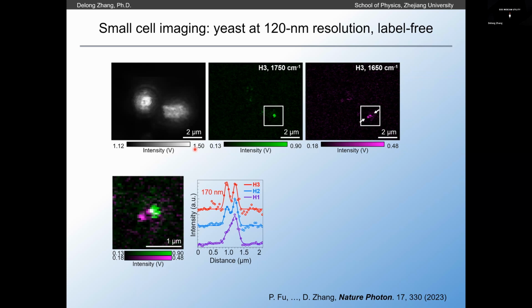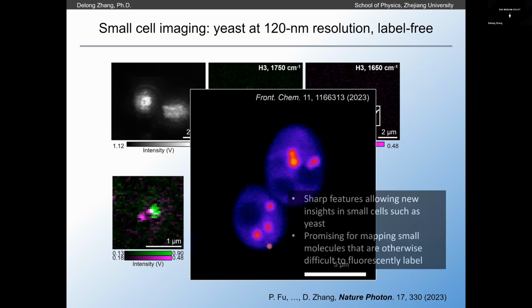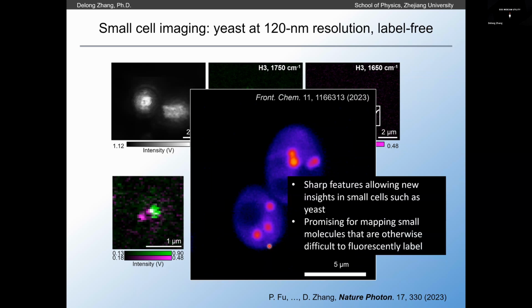If you compare this to a conventional SRS microscope, where we observe bigger yeast cells, the spatial resolution is very different, and this really gives us a lot of opportunities to explore the spatial temporal dynamics of various biological systems.